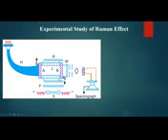Then the experimental liquid is placed inside AB, and a circulating water jacket is surrounding this liquid. This jacket also has a glass tube which is transparent. Continuously, water is going to circulate around the liquid in order to avoid overheating of the liquid.